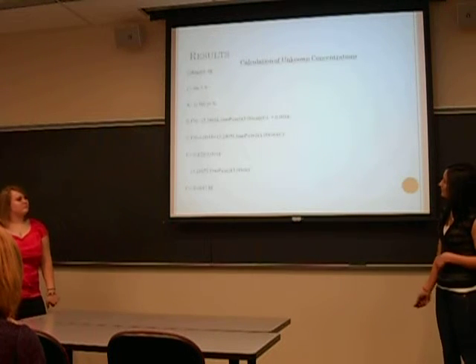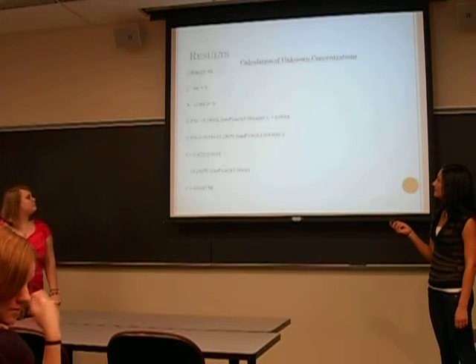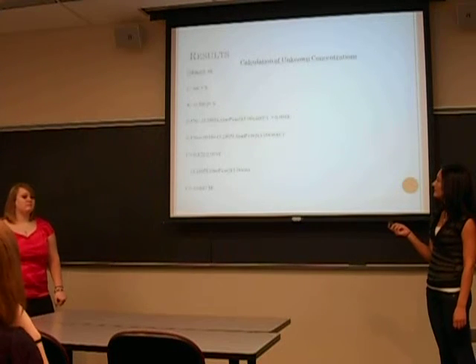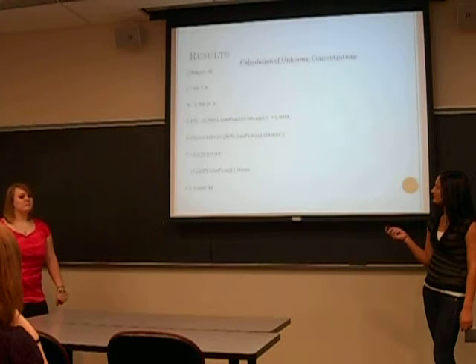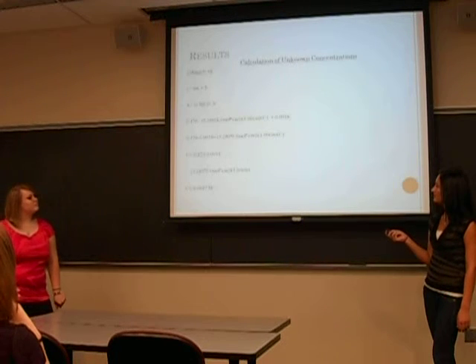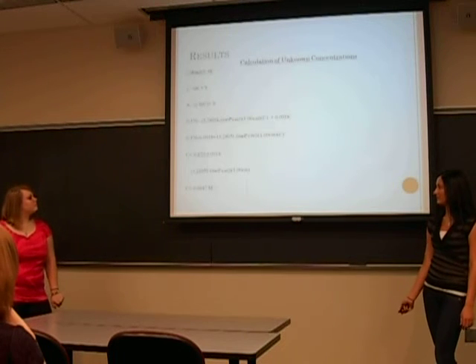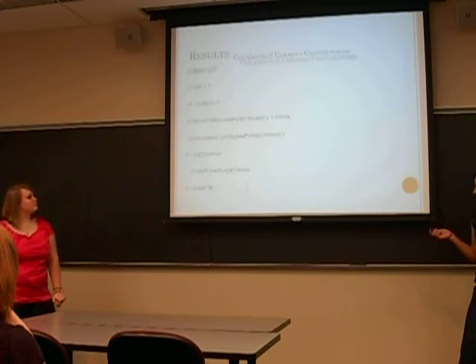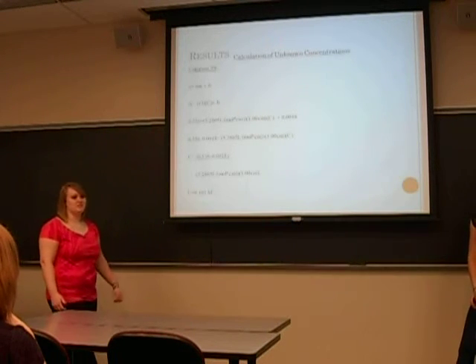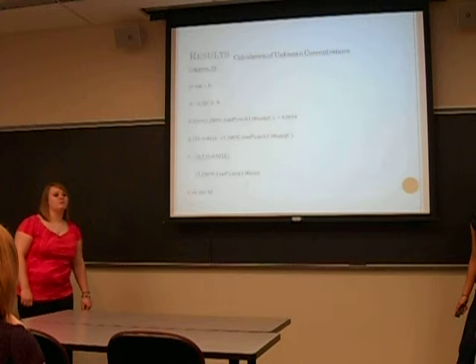This is the equation to determine the molarity of unknown 8. We take the equation for the line and we just transfer it to Beer's law. Plugging in the absorbance over here, we have everything else to figure out the concentration. So just solve it algebraically and end up with a concentration of 0.0887 molar. For unknown number 9, all we did was the exact same steps, just change the transmittance and absorbance, and we ended up with a concentration of 0.101 molar.